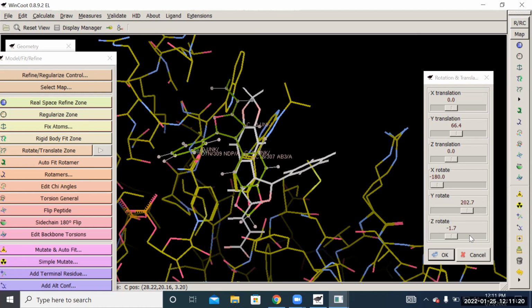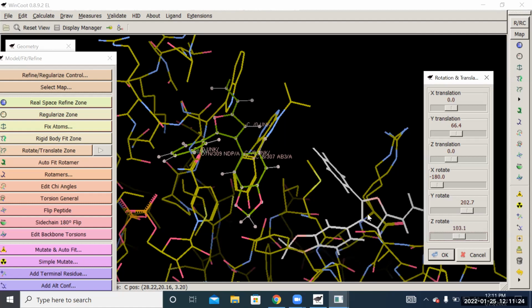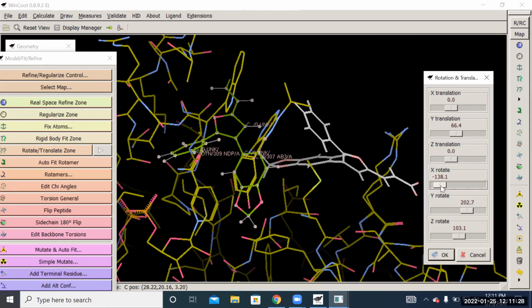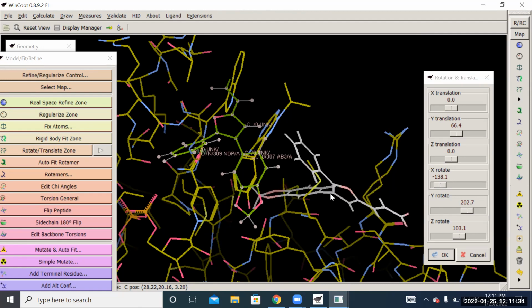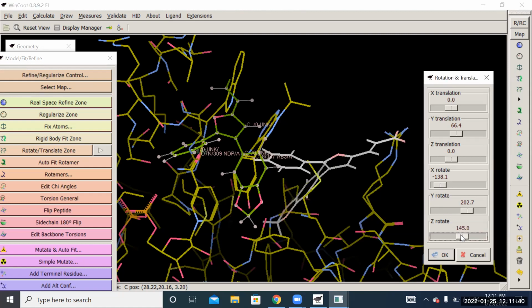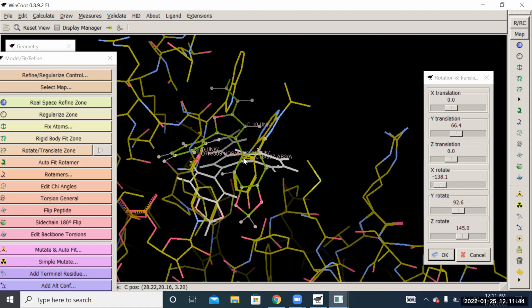See, what I had to do is flip it around, so it can get kind of nutty. And so I'm trying to get this worked in over here, remember. And this is the tricky part.